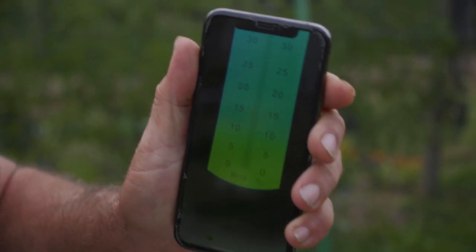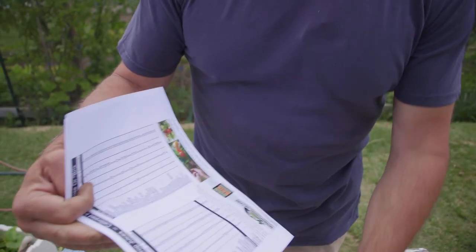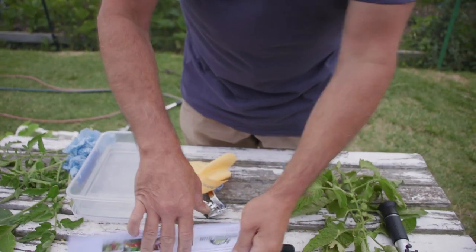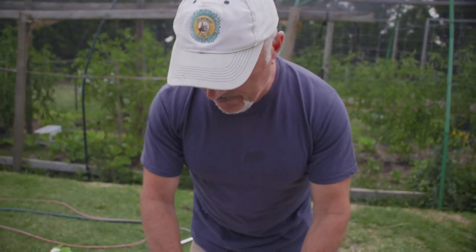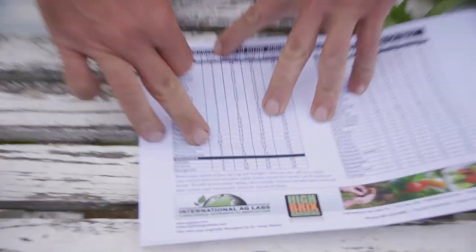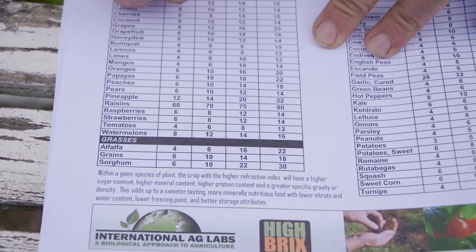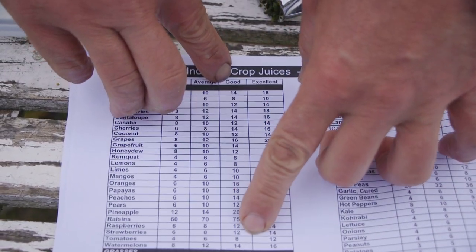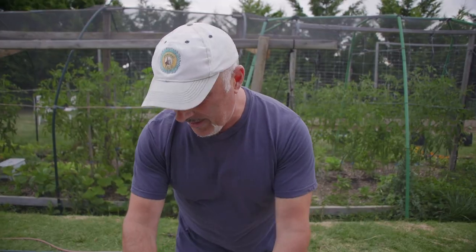So on the Brix meter, I've got a little chart here as well that'll give us the Brix chart measurements. For tomatoes, a poor performing tomato is at 4, average tomato is at 6, and we're sitting around 9. So we're good to excellent there. Now we're going to test the other one.